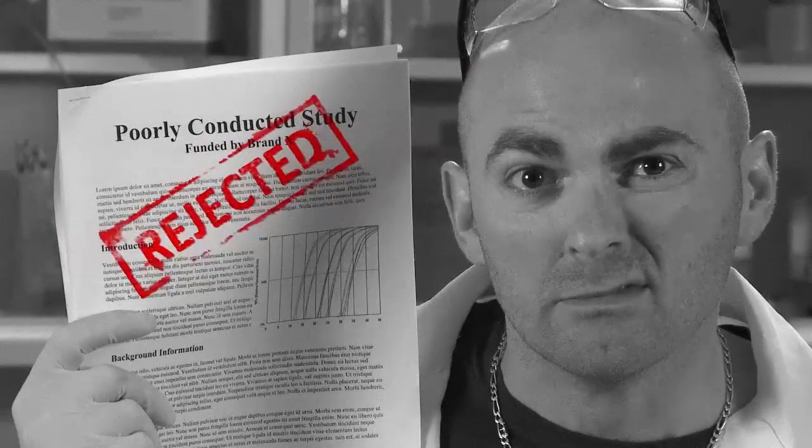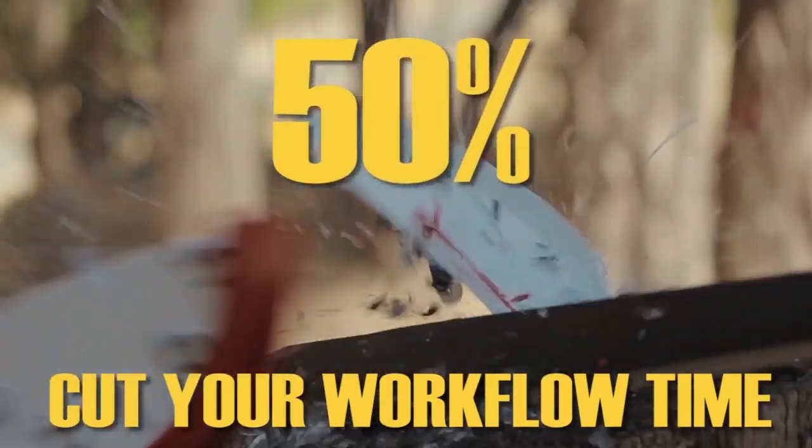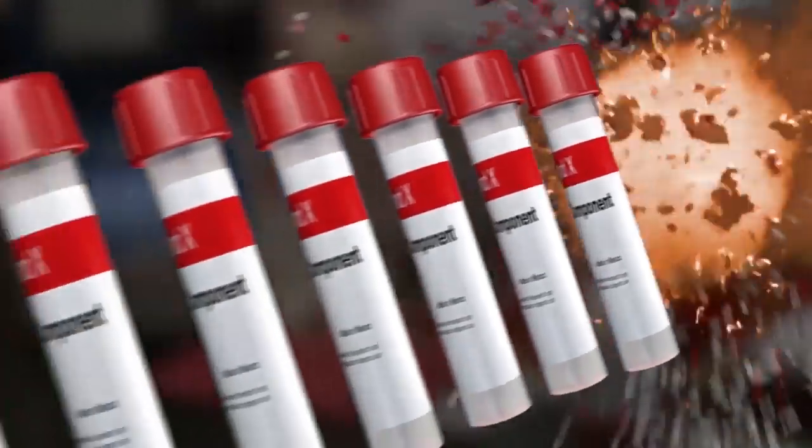Are you frustrated taking too much time to generate cDNA? Tired of opening tube after tube of reagents only to miss low expressing targets? Sick of rejection letters due to biased data? What if you could cut your workflow time by more than 50% while simultaneously obliterating the number of steps in your workflow?